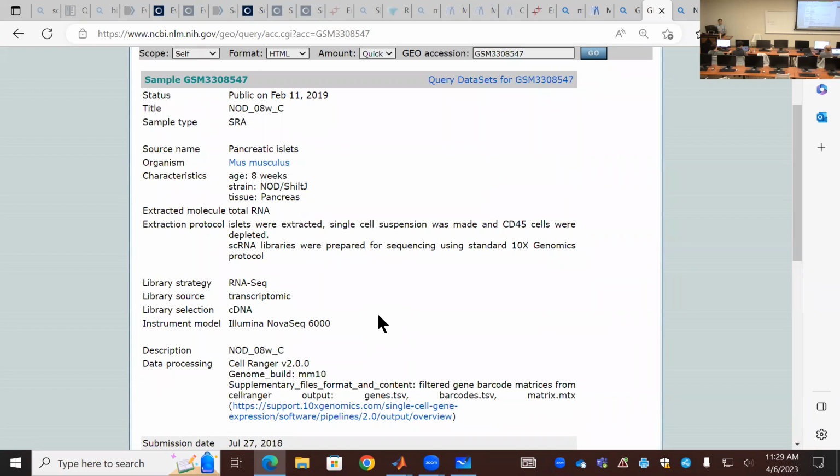Mix the cell. I don't know if it's a good idea. Yeah. When you mix the cells, internally you have 2 subclusters, and they are not a homogeneous population anymore. So this highly variable gene method is supposed to apply to a homogeneous population. So it's a good question, but yeah.